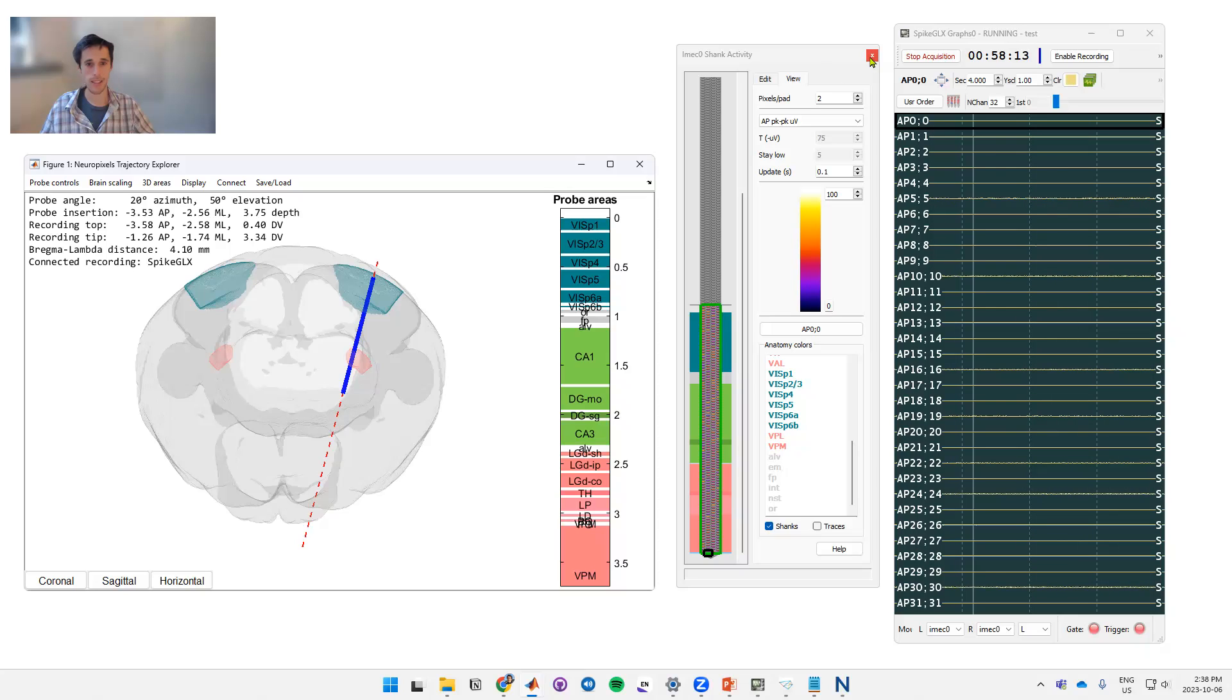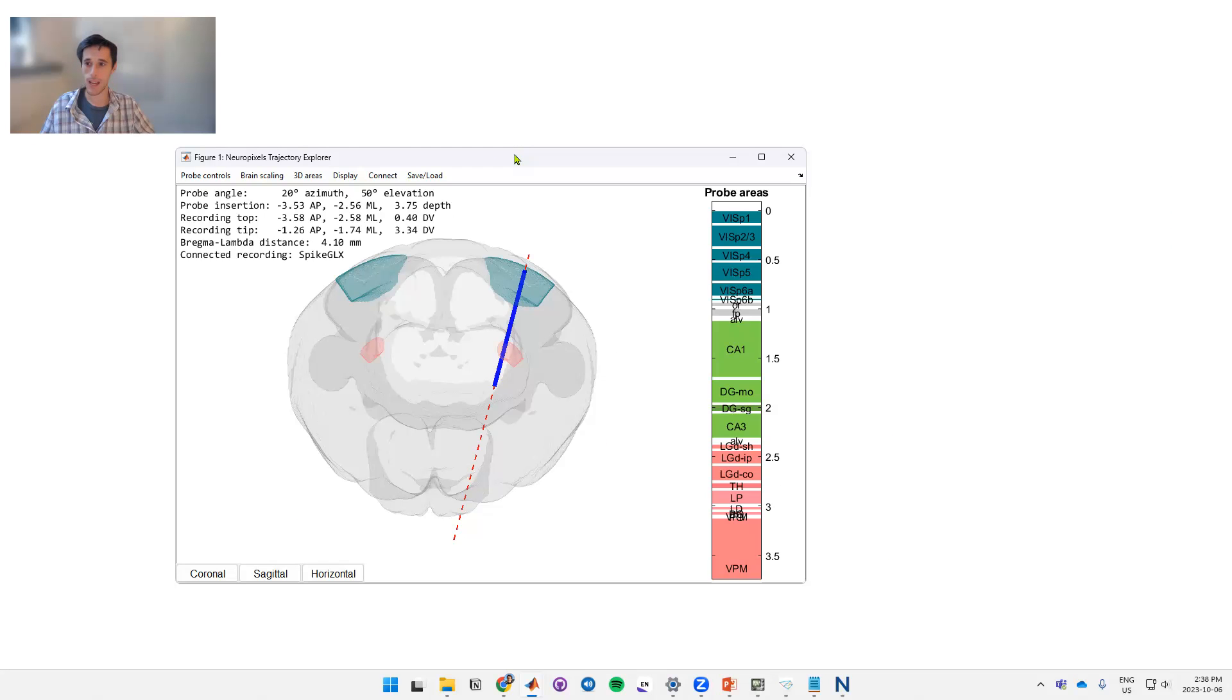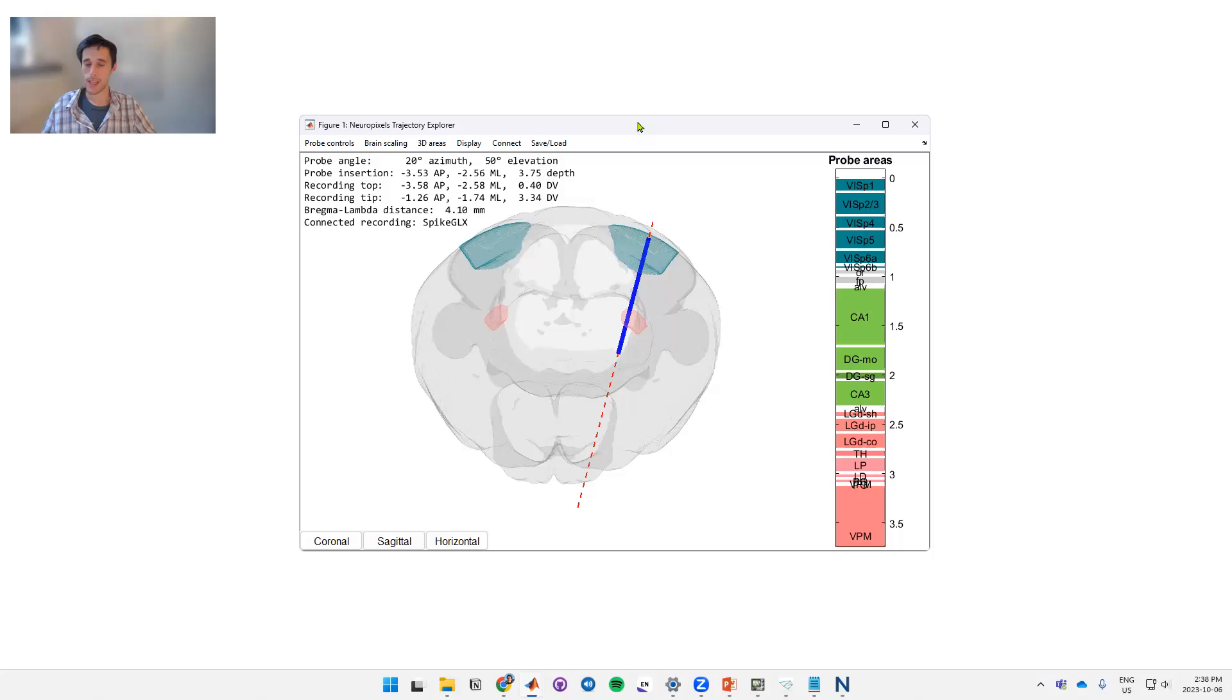Okay, so that is a general overview of the NeuroPixels trajectory explorer. I'm happy to answer any questions in the slack. Also if there are any issues or upgrades that are desired in the future, please open an issue on GitHub and I will address it as soon as possible. Thank you very much.